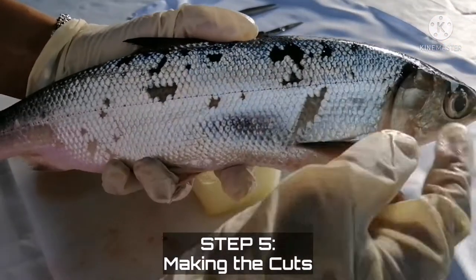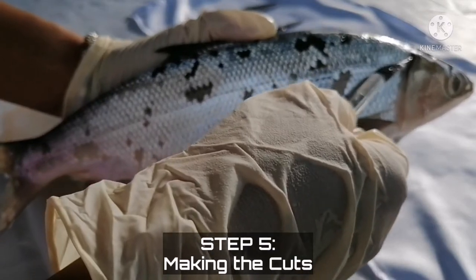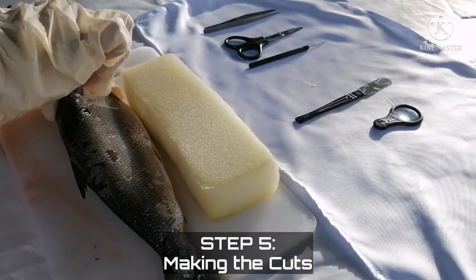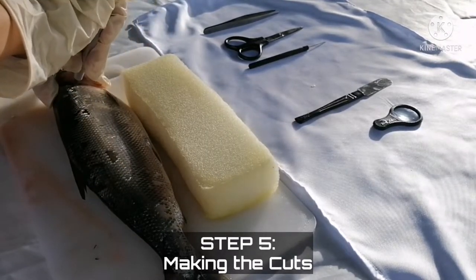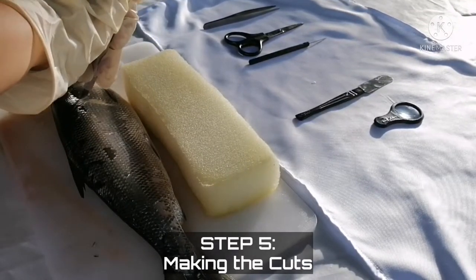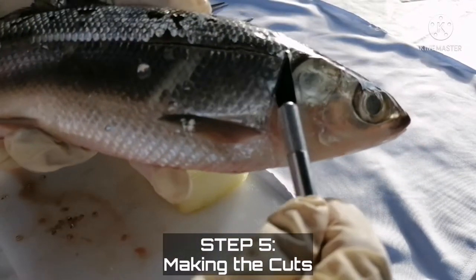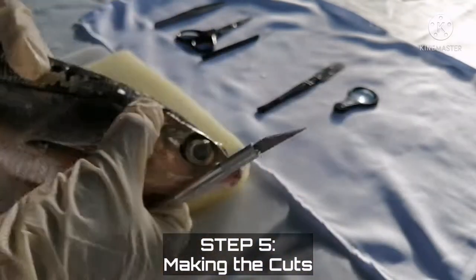After cutting from the anus to the gills, we also need to cut the lateral line for the fish to be open. You also need to be careful in cutting the lateral line open so that the digestive system won't be broken. Now, we need to cut a line from the lateral line down to the bottom of the fish to open the milkfish.